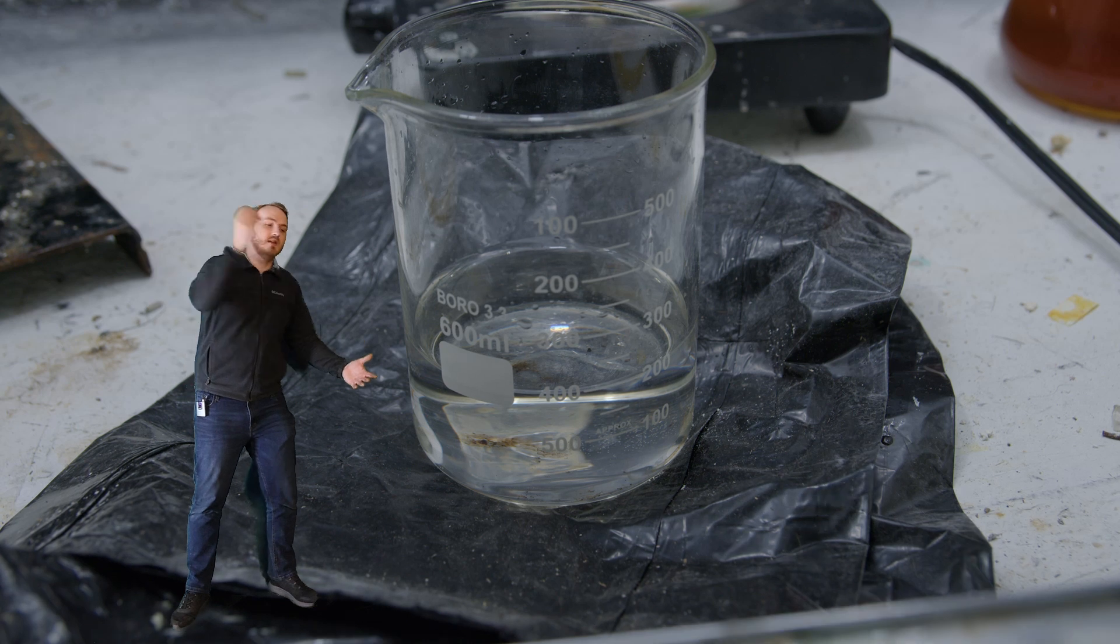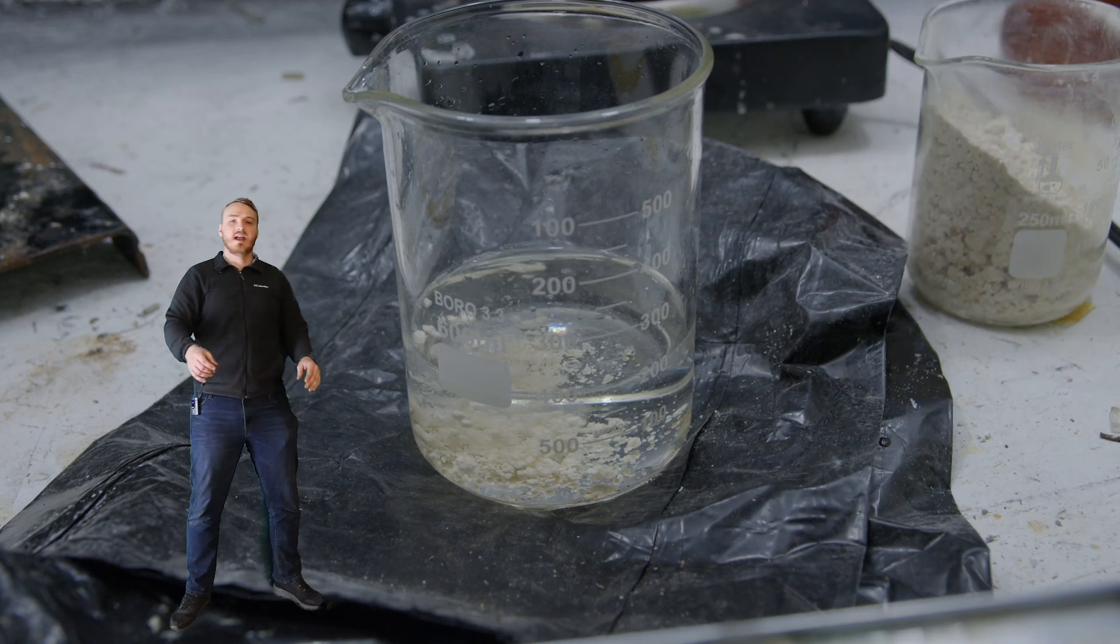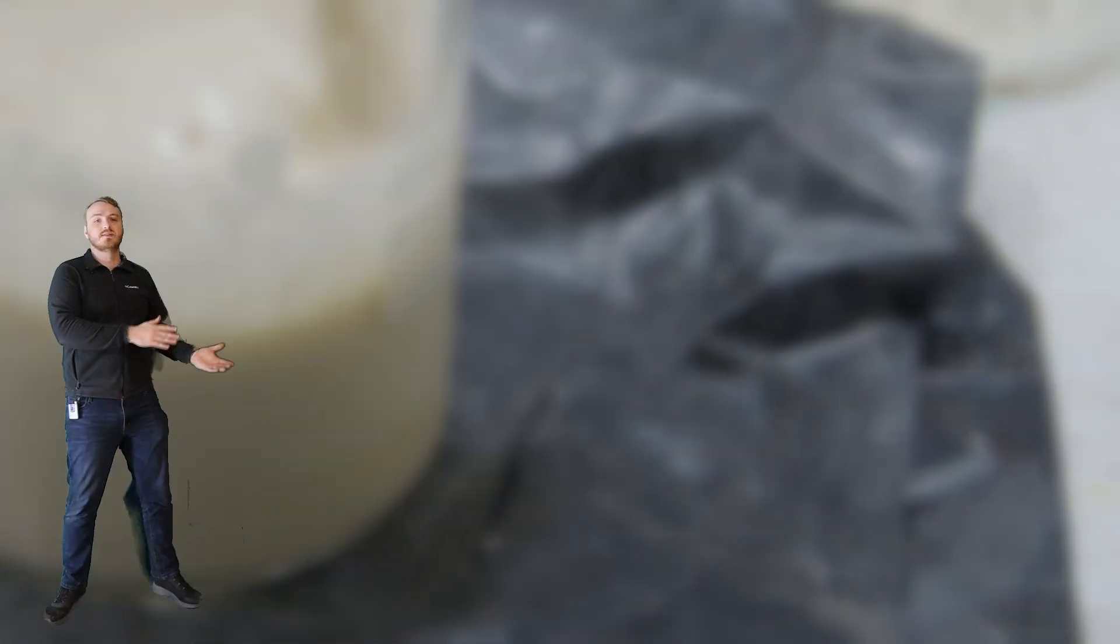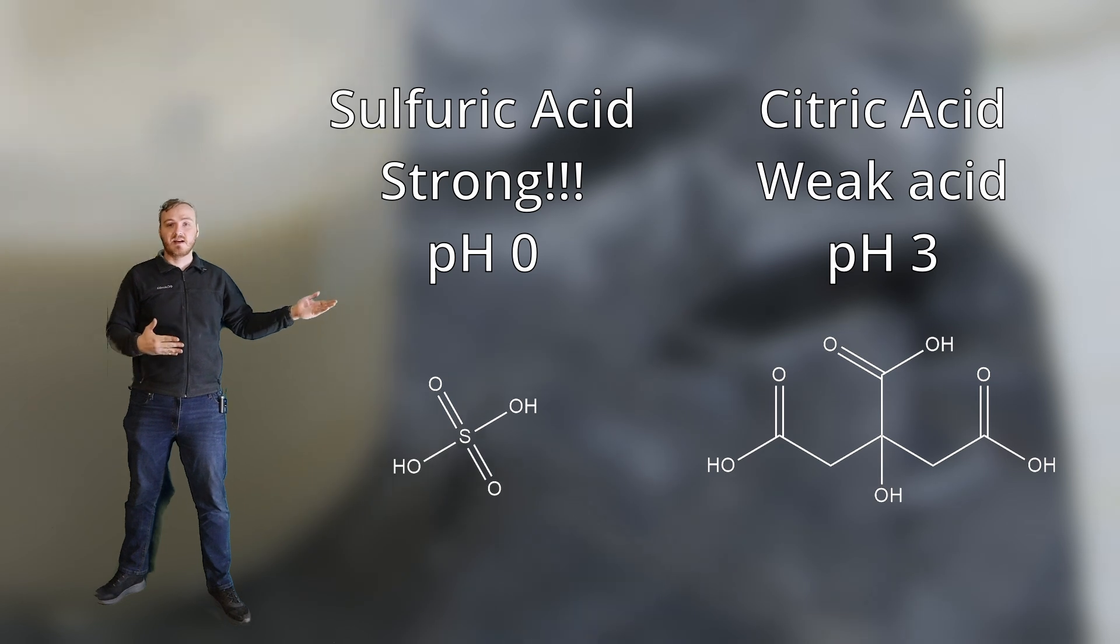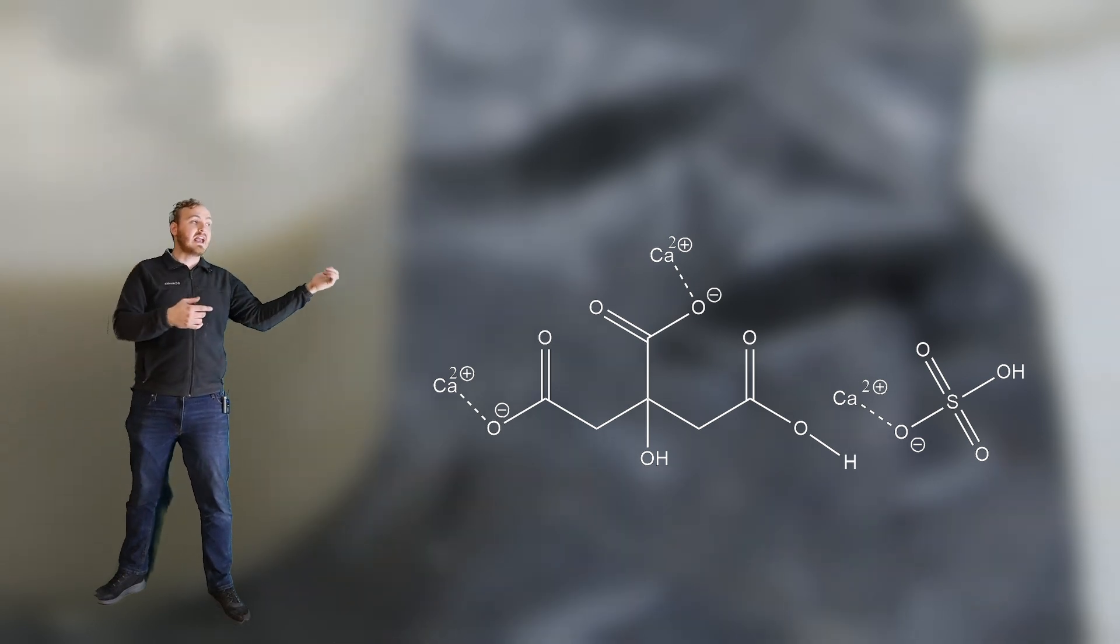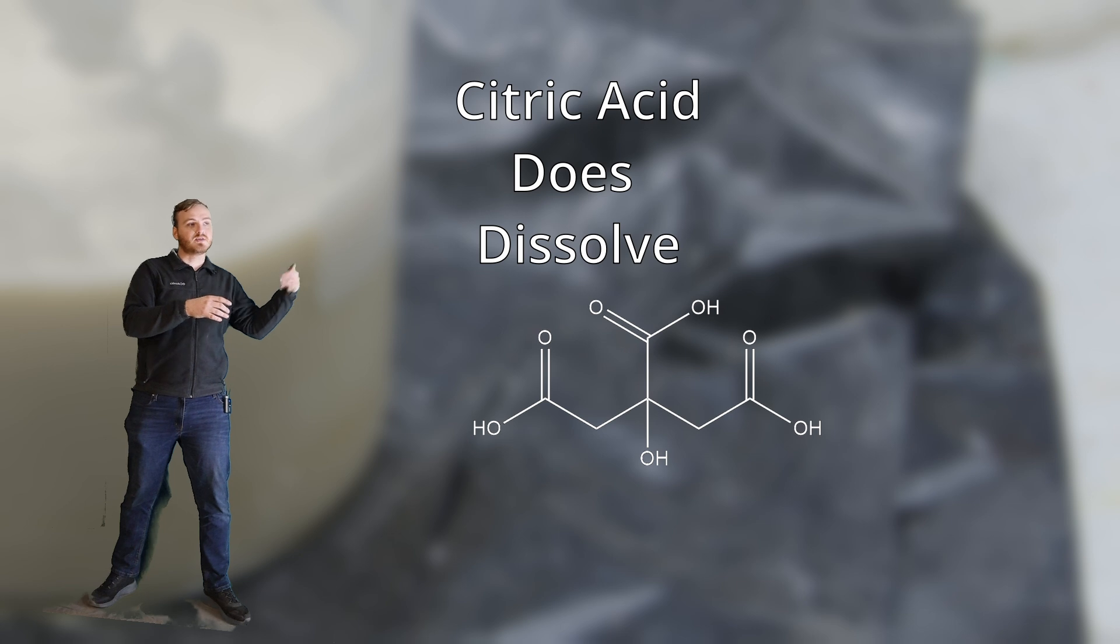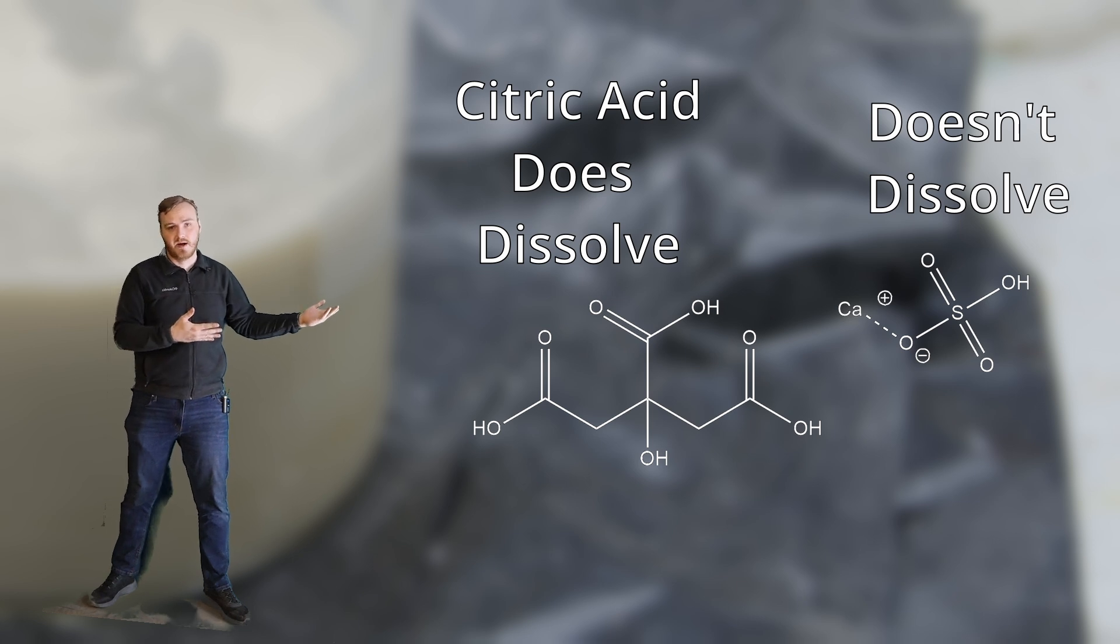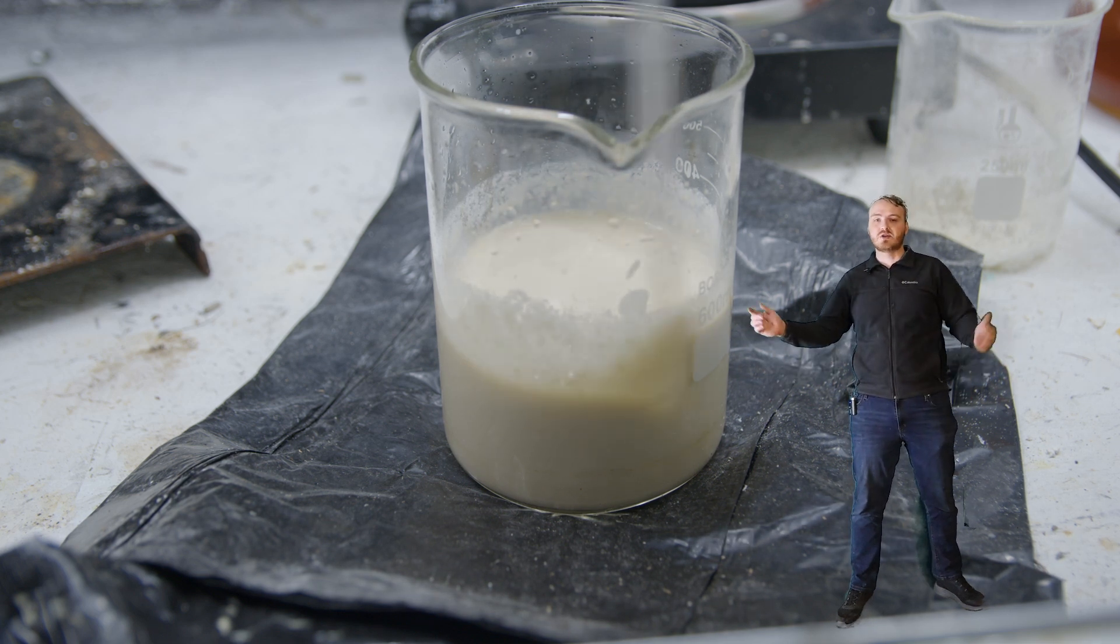We take the sulfuric acid and we diluted it to like 10% sulfuric acid and water. And we slowly start to add in the calcium citrate. We are very careful to keep the heat under control. We don't want this to get too hot. But what's happening here is very similar to the first step that we did. The sulfuric acid is a stronger acid than the citric acid that we're making. So it's going to take its hydrogen and give it to the citric acid. Then the calcium is going to go back onto the sulfate. And now that it has hydrogens, it is soluble. And the sulfate ion took the calcium, so now it's stuck with it and it's not soluble now. So we did this reaction over a few hours and it's kind of hard to know how much has progressed. We just sort of went with however much time we could spend on it.